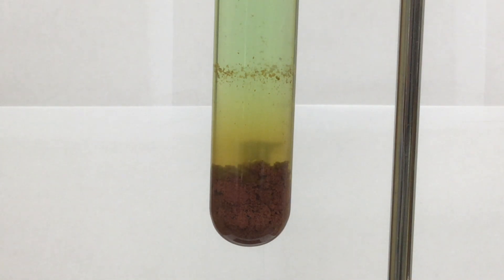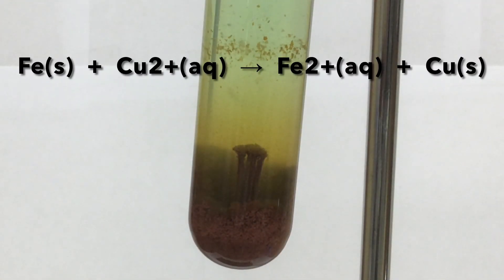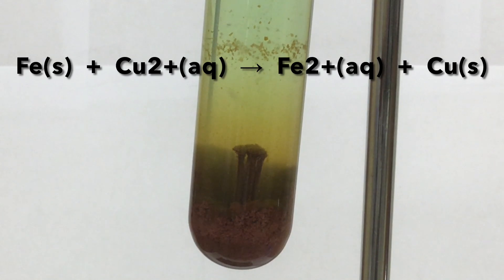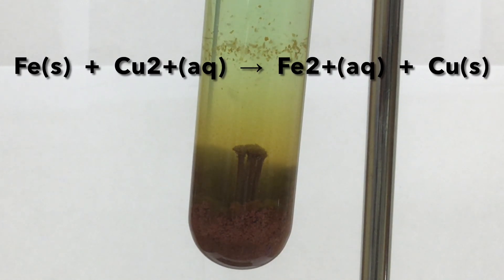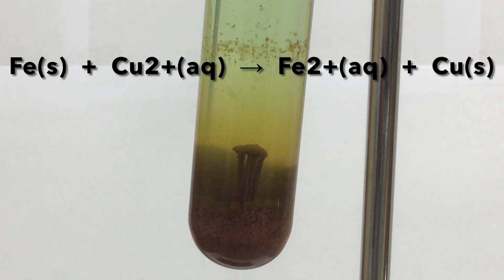If we just focus on the species that are reacting, here's the net ionic reaction. The iron atoms are being oxidized into iron 2 ions, and the copper 2 ions are being reduced into copper atoms.